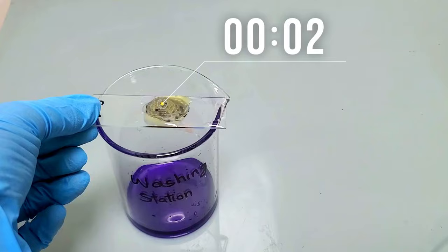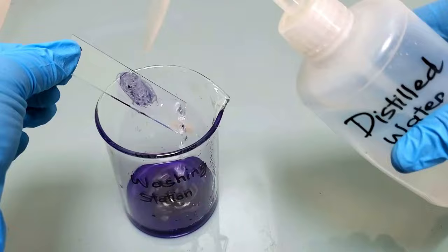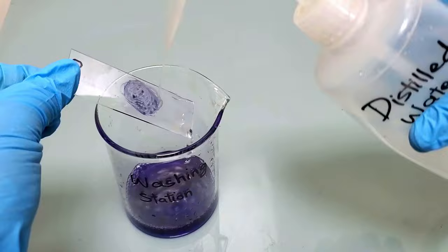Now, wash the slide with a gentle flow of distilled water. Second step is done.